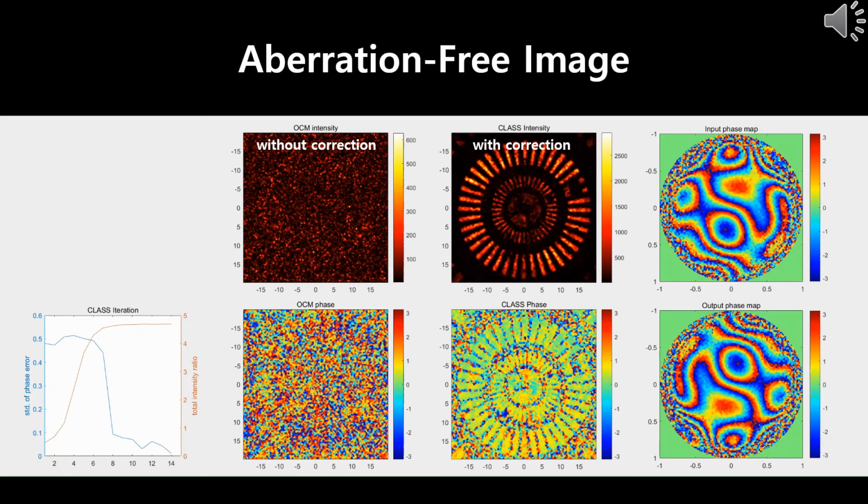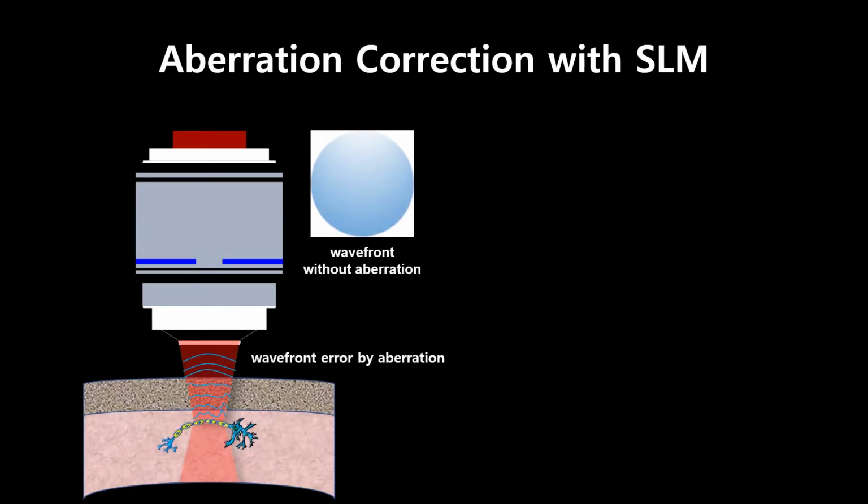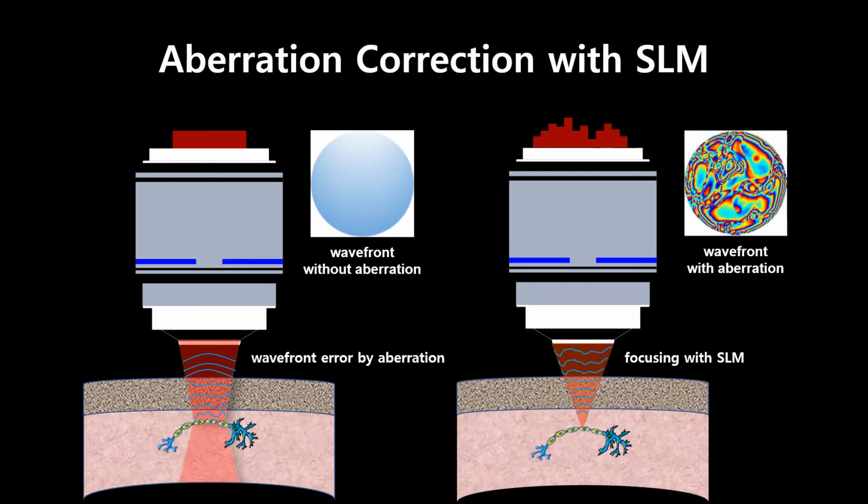The aberration when the wavefront of light enters the object from the outside and the aberration when the light goes out from the inside of the object can be calibrated separately. By compensating the aberration obtained in this way on the distorted object image, a clear image can be obtained. If normal plane light is incident on the skin tissue, distortion will be severe due to aberration and scattering from the tissue. However, if the complex light wavefront composed of inverse aberrations is incident on the skin tissue with the aberration found in the reflected image, it is accurately focused on the target to be imaged, and a fluorescence image without distortion can be measured.